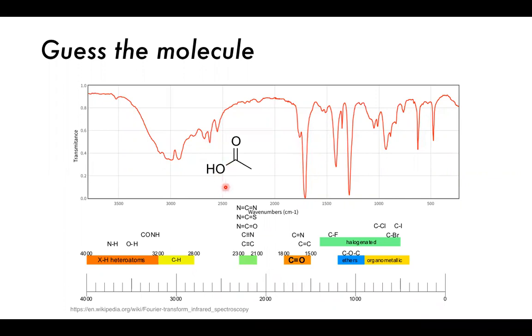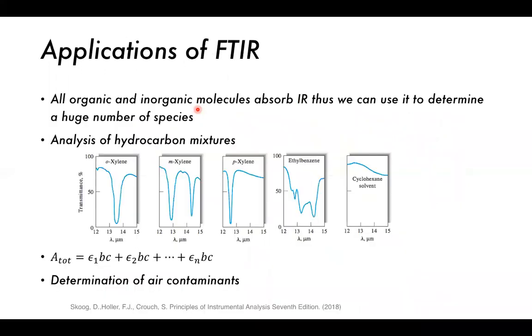So that's just a little exercise to test your mind and see if you can use some of the knowledge that we've gained. So the applications of FTIR: all organic and inorganic molecules absorb IR, thus we can use it to determine a huge number of species.